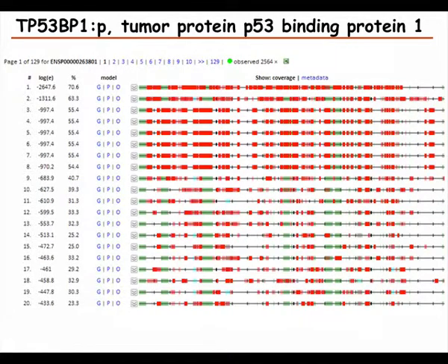So if we now, again, we've looked at this a little bit before, the first view would be the top 20 experiments and an overview of what peptides have been observed in the protein by these different experiments.